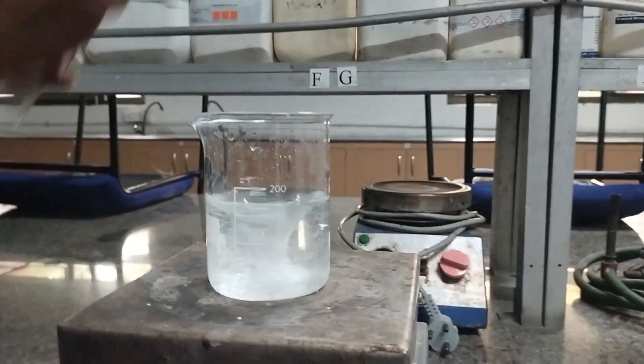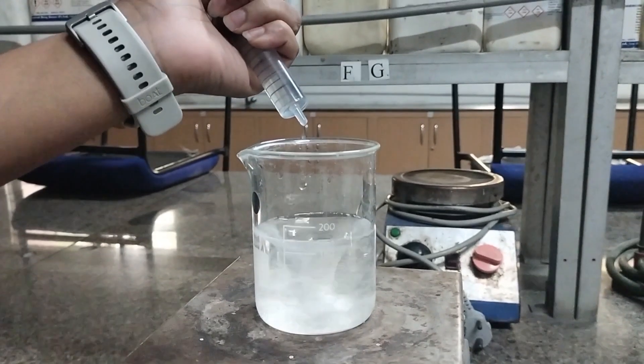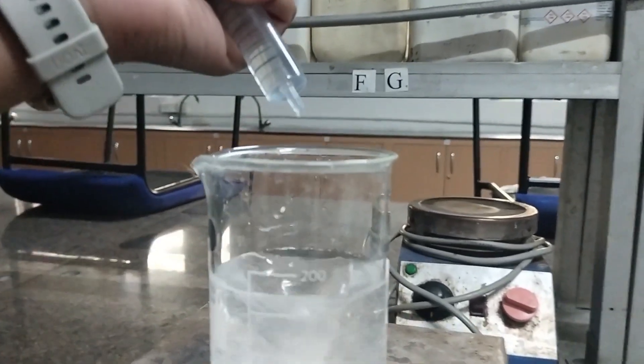Then the internal phase is added to the external phase dropwise with continuous stirring, and the solution is continuously stirred for two hours.